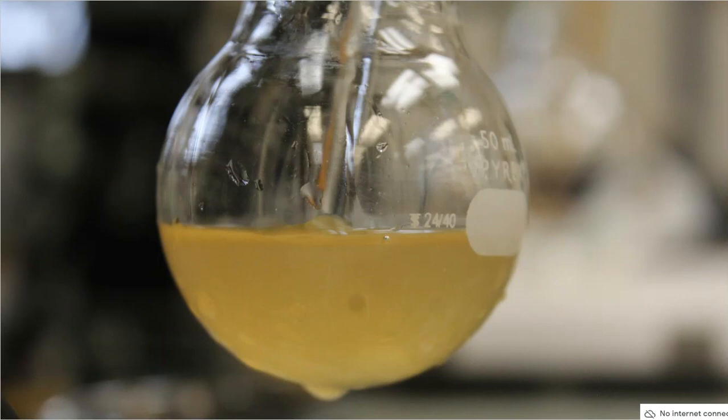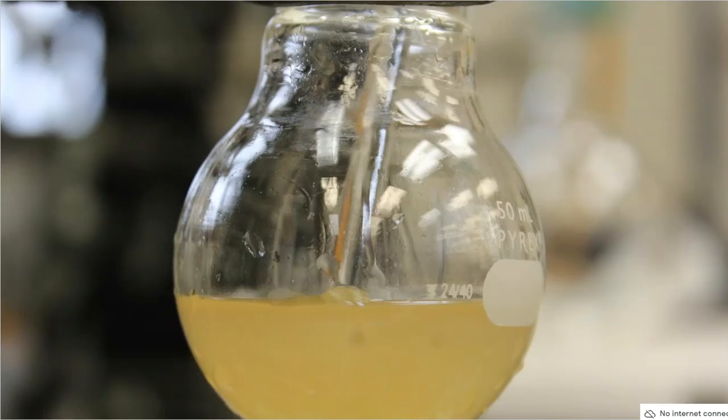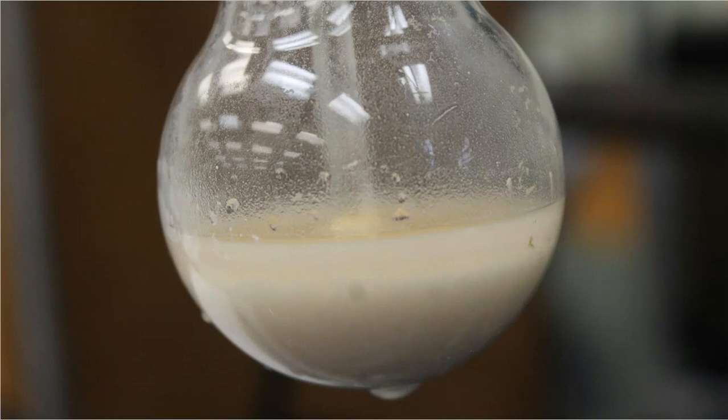All right, so here's another close-up of that step. That way you can pause it, make observations as you need in your lab notebook. Here's just another picture, maybe a little bit closer up of 1 or 2 minutes after that process happened. And then I felt really good about this, so I walked away. I walked away for probably 10 minutes, I guess. And then I came back, and this is what I saw in the flask.